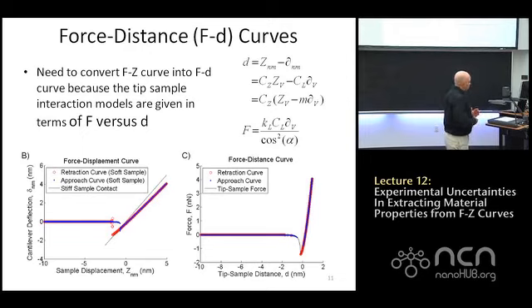We've measured... You don't have to make any adjustments because you are using a round tip or a pointy tip like a triangular? For small indentations, definitely not. If you want to talk about very large indentations, well then, I imagine the situation could perhaps become more complicated because the indentation could be significantly different as you move along the tip. Yeah, but by and large, 90% of the cases so far, tip geometry doesn't play a role. Yeah, I can't think of a case where that would be an important issue.